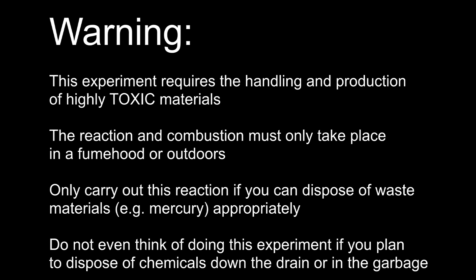This experiment requires the handling and the production of highly toxic materials, so a lot of care must be taken. The reaction and the combustion must only take place in a fume hood or outdoors due to the production of many toxic gases. This reaction must only be carried out if you have the ability to dispose of waste materials, like mercury, appropriately.